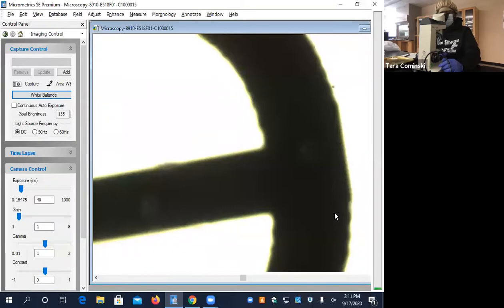All right, cool. So draw what you see there, under B. You're just going to draw a bigger E. Right, so that E is magnified. If you guys are following along, you can draw what you see on my screen on Zoom, okay? The E gets bigger. Because why? Now you're using a 10x objective here, right? Before we were at 4x, now we're at 10x.